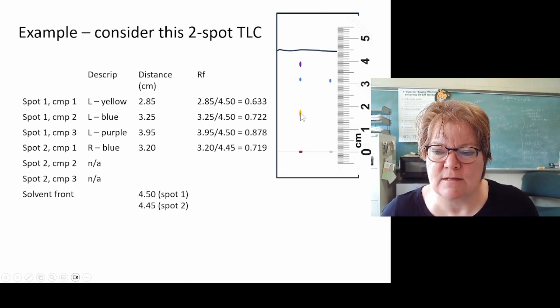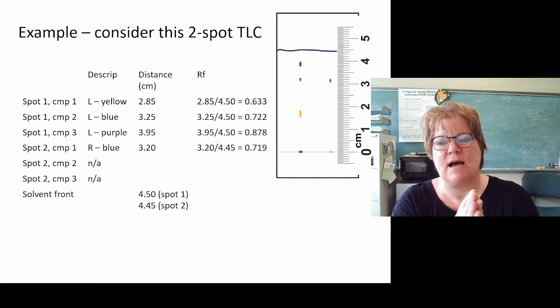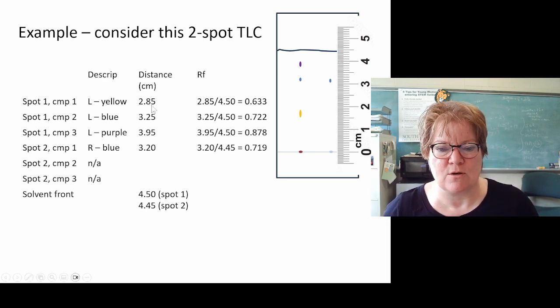And you can check me. It's a little hard when the ruler is not right next to the spot. I know that, but I measured it for you, but you can just make sure. So I have 2.85. If I look at this farthest edge, you can see it's like right here.